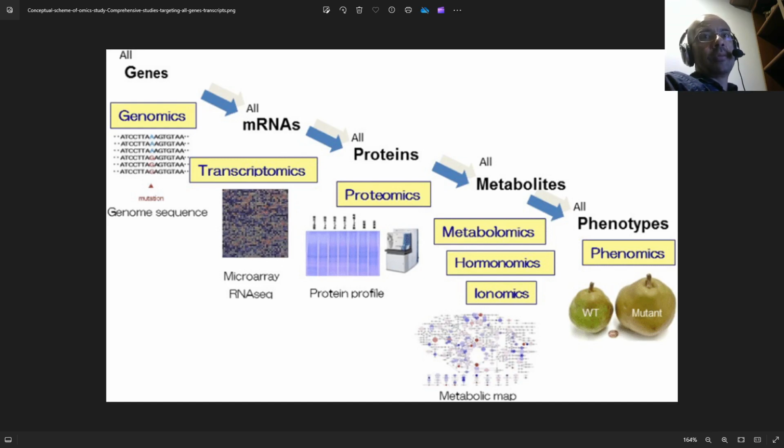In our upcoming laboratory experiments, we will be working with RNA sequence data from both mice and insects to explore these concepts further. With this foundation in mind, let's dive into the laboratory activities. Let's get started. Remember, the first step in this journey is data collection, and in the case of fruit flies, we can obtain valuable information from modencode.org.